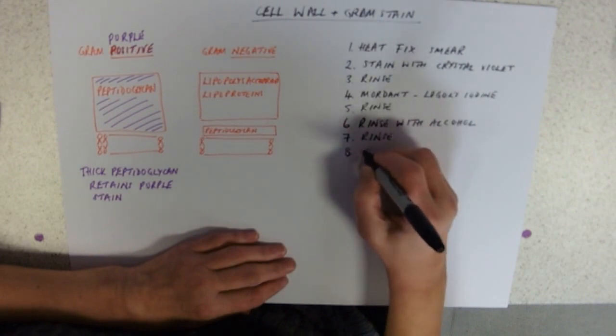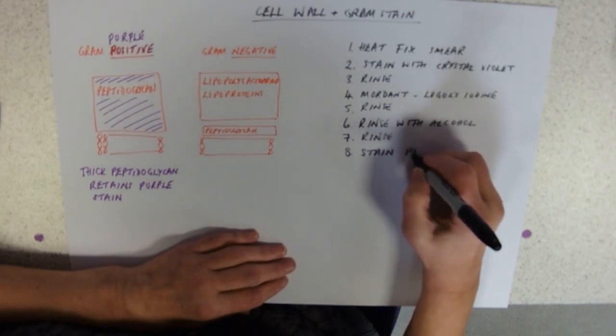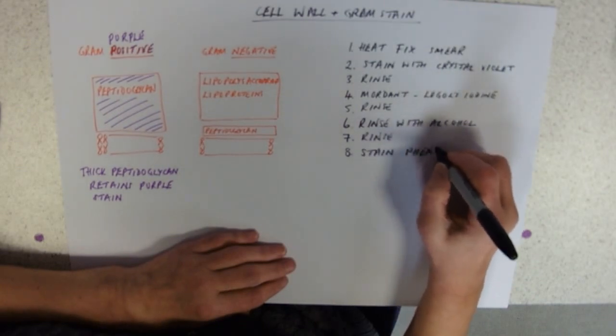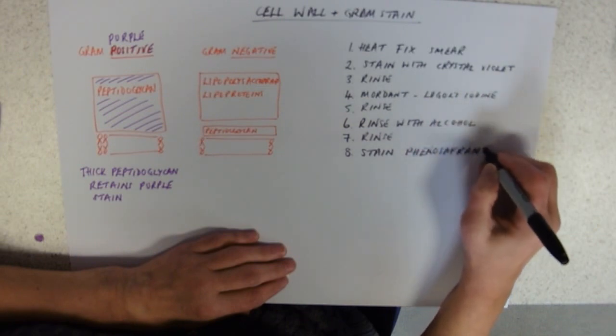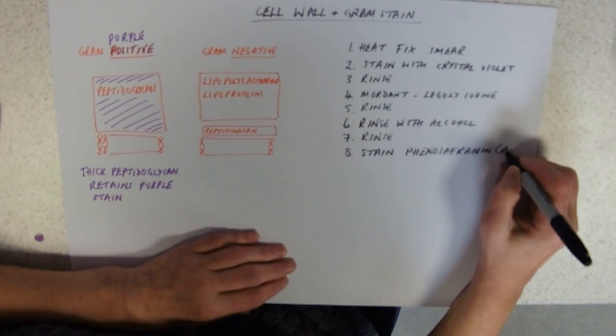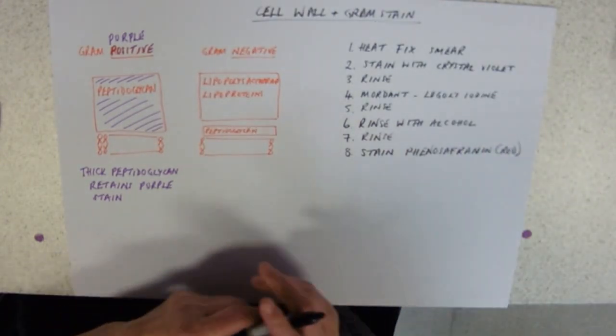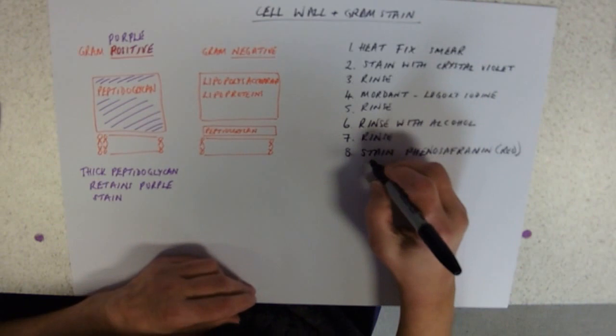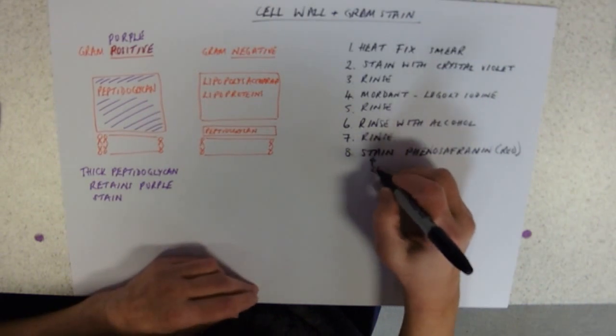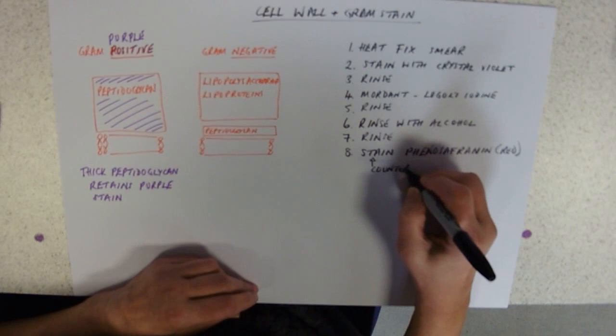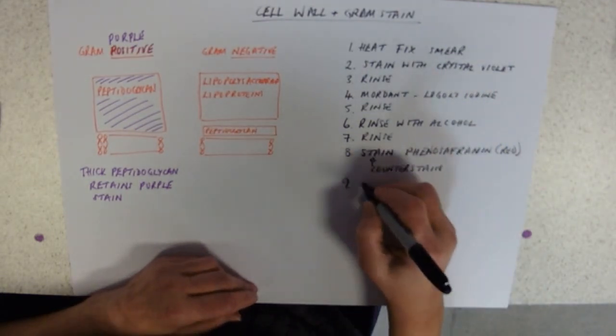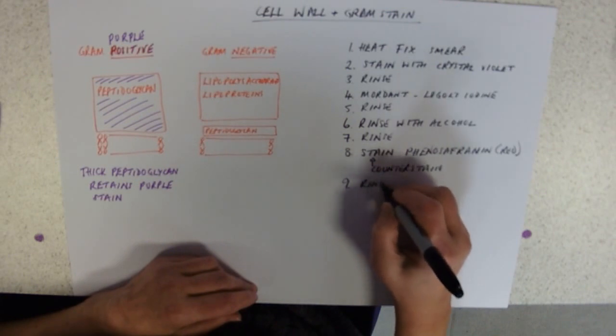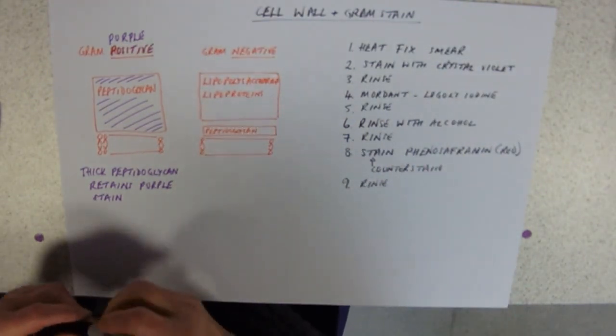And then you apply the counter stain. So you stain with phenosafranin, which is red. This is a counter stain, that means it will stain the bits that haven't been stained before. And of course, you rinse. You then need to dry it and shove it under a microscope.